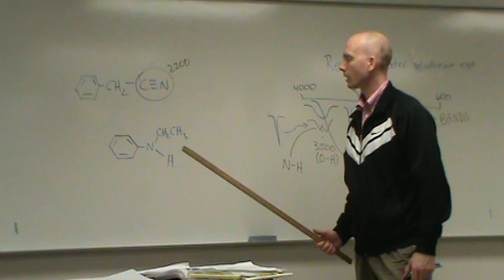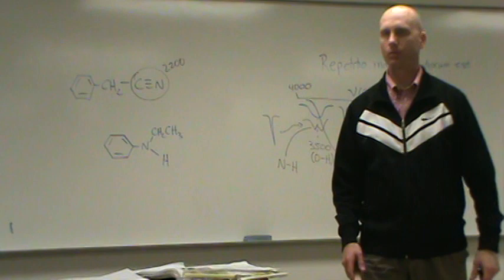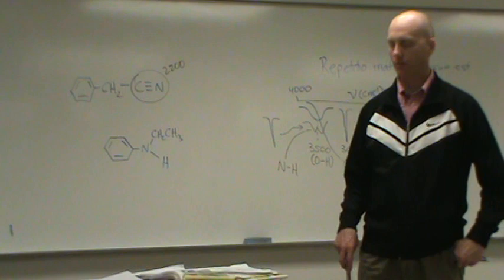And the bottom one, what's sticking out about this one on the spectrum? What's sticking out on that? Nothing that the other one doesn't have. Okay, tell me something that's in there that's on the graph. The CH bonds and the carbon. Well, CH is no big deal. Carbon-carbon double bonds. Carbon-carbon double bonds.